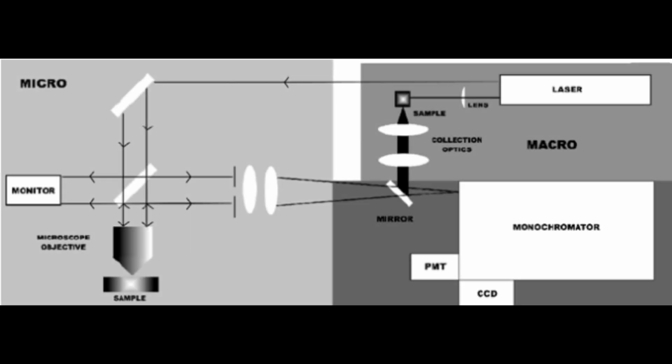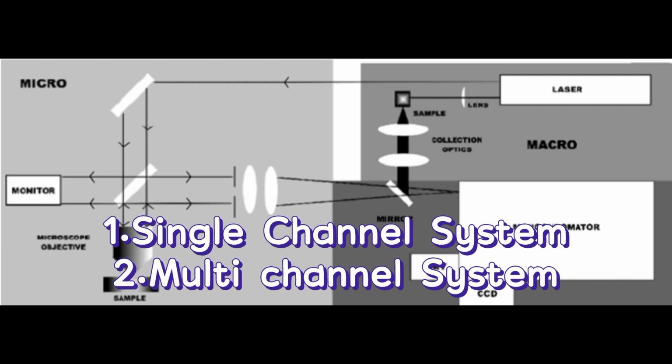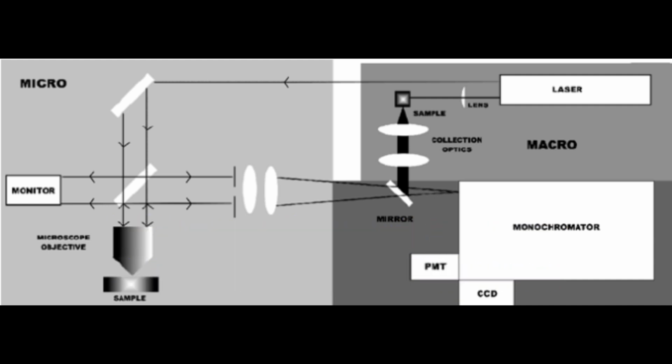The Hyper Raman uses the typical nanosecond giant pulse laser, which would deliver about 10 to the power of 17 photons to the sample at a single shot. There are two methods to observe the scattered radiation at such low intensities. In both cases, the scattered radiation from the sample was collected with a wide angle lens and fed to the grating system, which disperses the radiation.